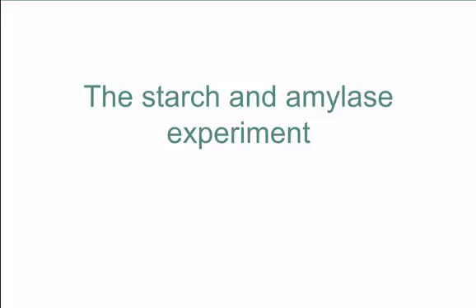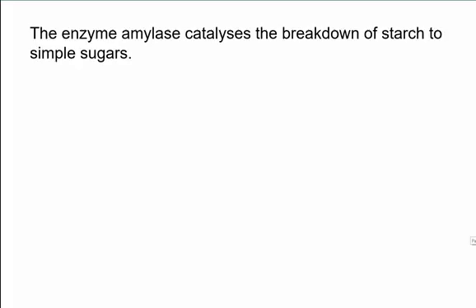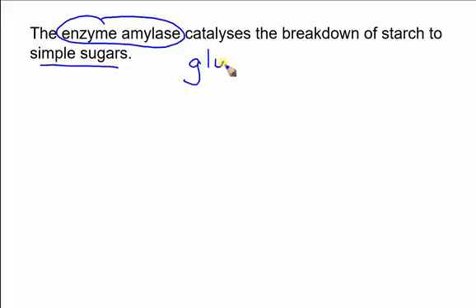This presentation is going to review the starch and amylase experiment that you did in class. In this experiment we used the enzyme amylase, and that was salivary amylase. So we used our spit to break down starch into simple sugars, and those sugars were glucose molecules.